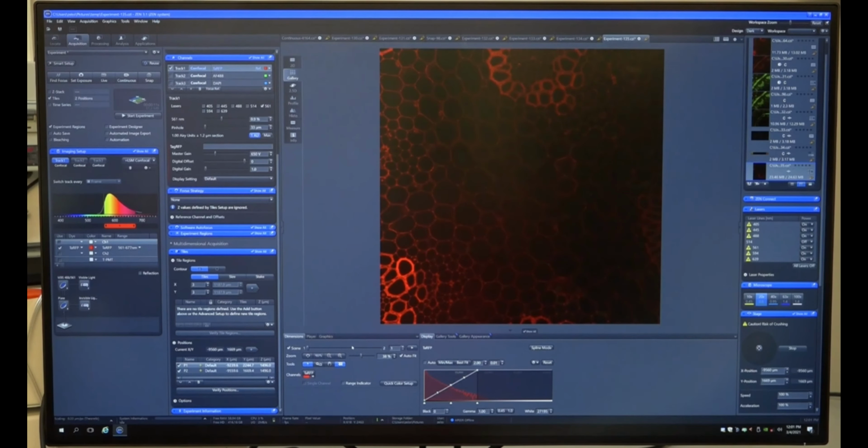Okay, I can have multi-channels, I can have Z-stack, I can have time, everything I can have for different positions also. So if you are using a multi-well plate for well A, well B, well C, whatever it is, you can do it with a different time gap also. You can do for Z, you can do for different multi fluorophores also. So all this is possible here.